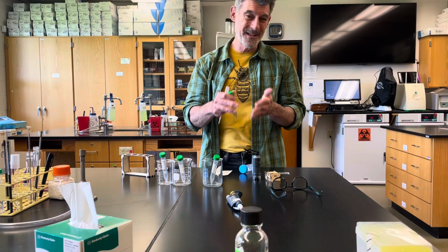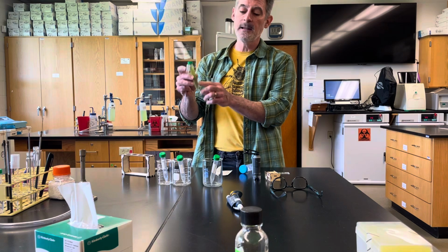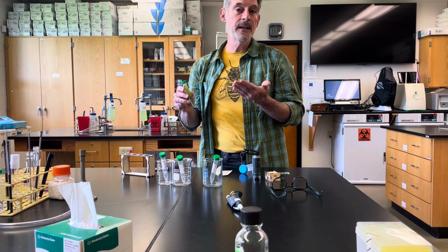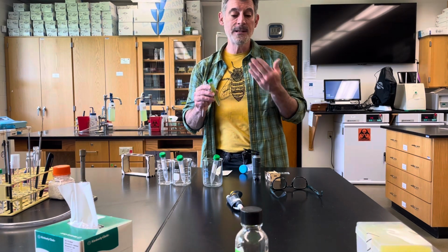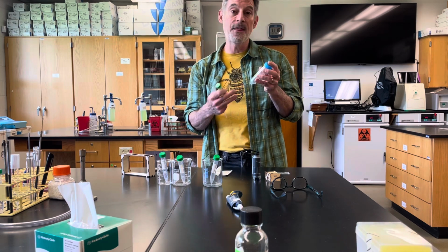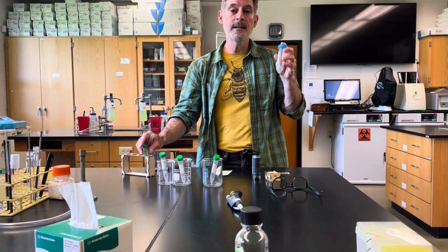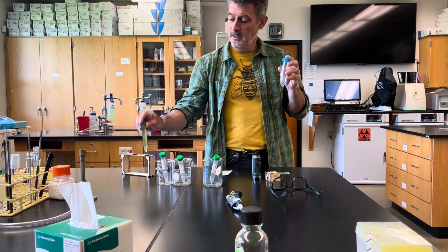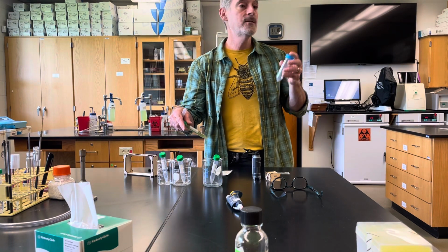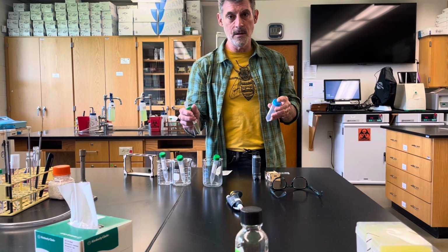You're going to add a specific amount of water to the tubes, and you're going to add a specific amount of this algae. The thing is, you're going to have 15 milliliters, so 5 milliliters of algae are going to go into each of these, and then you're going to fill it up to 15 milliliters. That means you need 10 milliliters of this to go into each of them, and you have 50, so you need 30. So you should have extra of this. This is salt water. So keep this in mind. These are marine algae. If you put the 5 milliliters into these containers and then just add water from your tap, you're probably going to kill them. I don't think they're going to survive at that salt concentration.